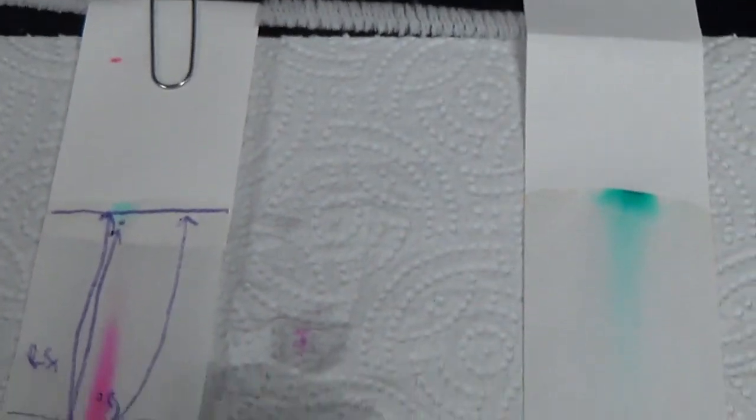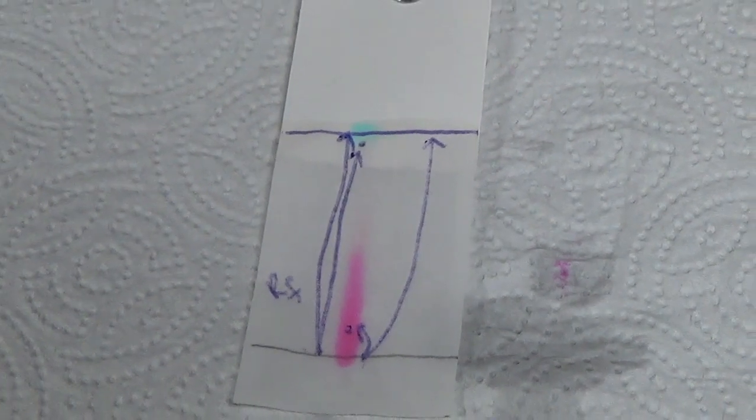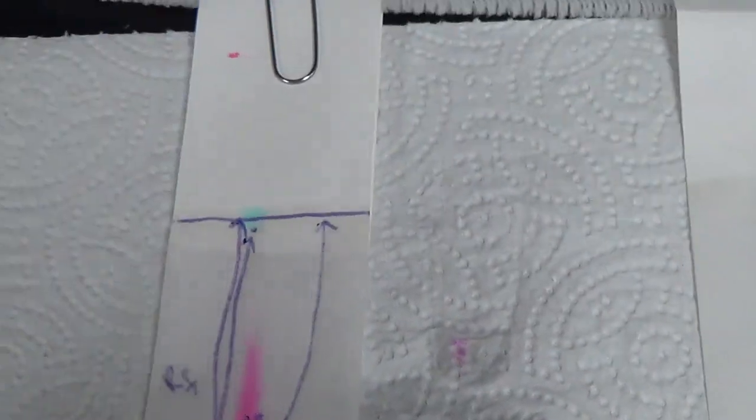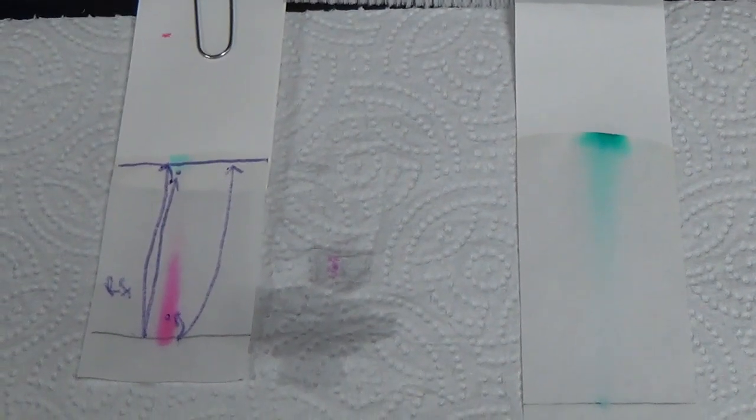Okay, so that's paper chromatography, and that's what you need to do tomorrow. So you're going to set it up tomorrow with your assigned color. I'll assign you a color. You don't get to pick. And while it's dissolving and the water's moving up the paper, we will discuss how this actually works in great detail. All right, so this is our lab for tomorrow. Be sure you have paid attention and are ready to go.